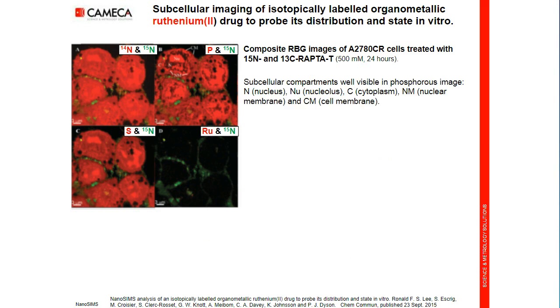And a second remark is that ruthenium was analyzed here in negative mode. So the ionization in this mode is not very high, so the image acquisition is very long, maybe nearly a full day. In the future, it would be possible to record ruthenium plus under O- bombardment to get a better ionization. But even with these low yield conditions, the instrument is stable enough to keep the intracellular lateral resolution.